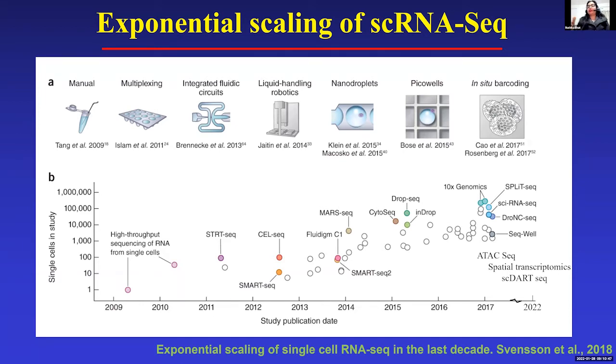This is a new technique that has emerged, which combines both ATAC and RNA, and recently a publication came which claimed to identify, just using the methylated sites, how the cell types differ and which stage of cell cycle they are in.